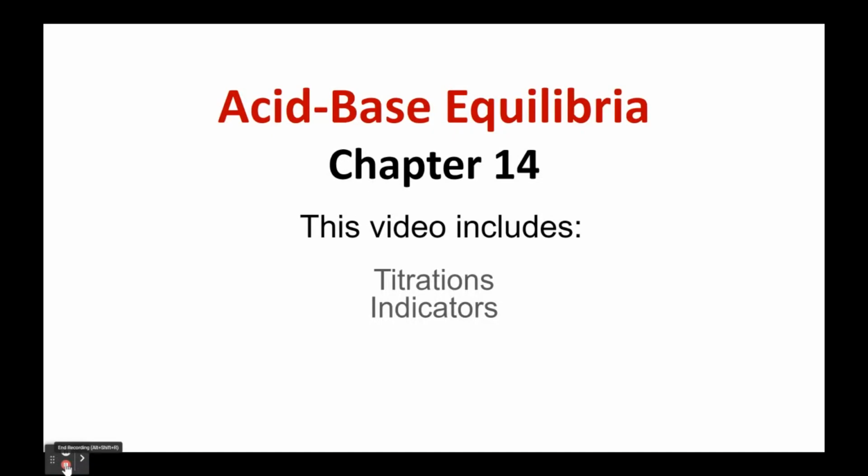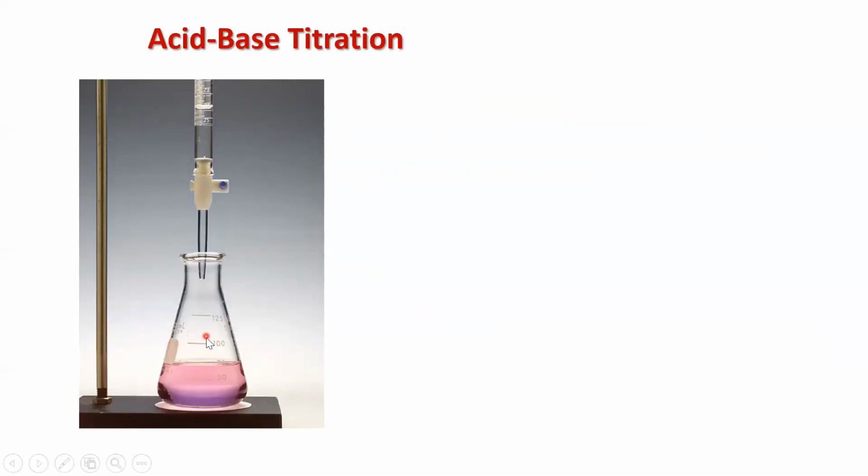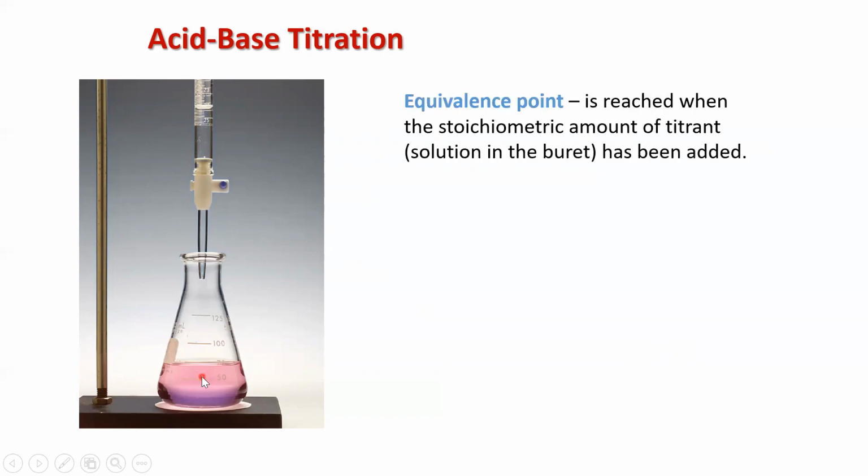Hello, this video includes information on titrations and indicators. We have a solution down here and we have a solution up in our burette, and we're going to add the solution from the burette to the solution in the flask. And we have 2 points that are important.